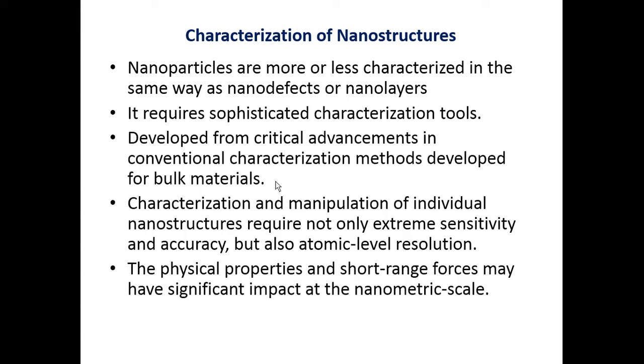But when it is nanostructures, the material is of nanometric level, so the characterization tool must be capable of measuring the properties of such materials in nanoscale with atomic resolution. So we have to develop tools to know both the physical and chemical characteristic features.